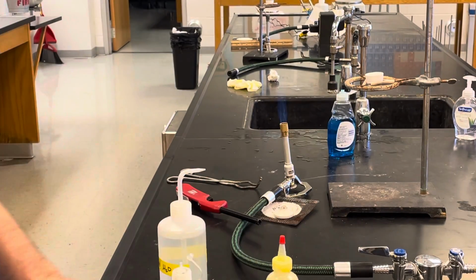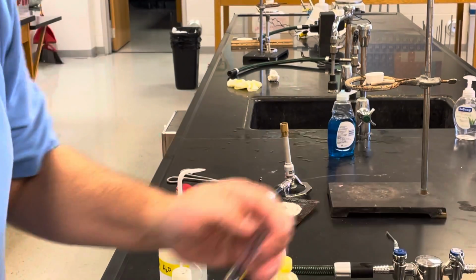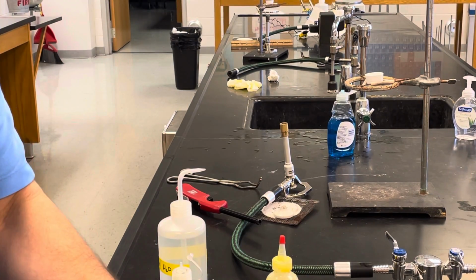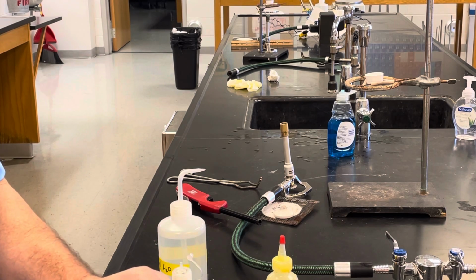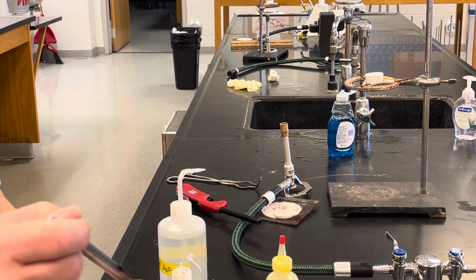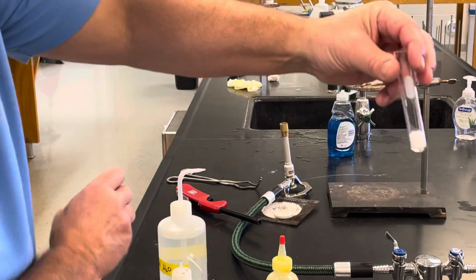Now, we'll talk about that in a second, but the last part of this says to take some ammonium chloride, solid, and I put that into a test tube, and then I just add some water to it.